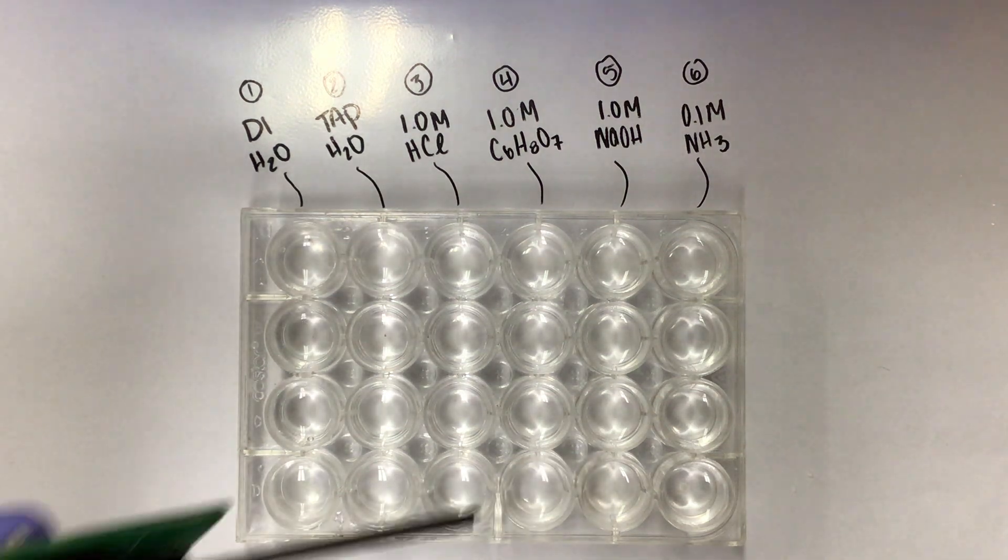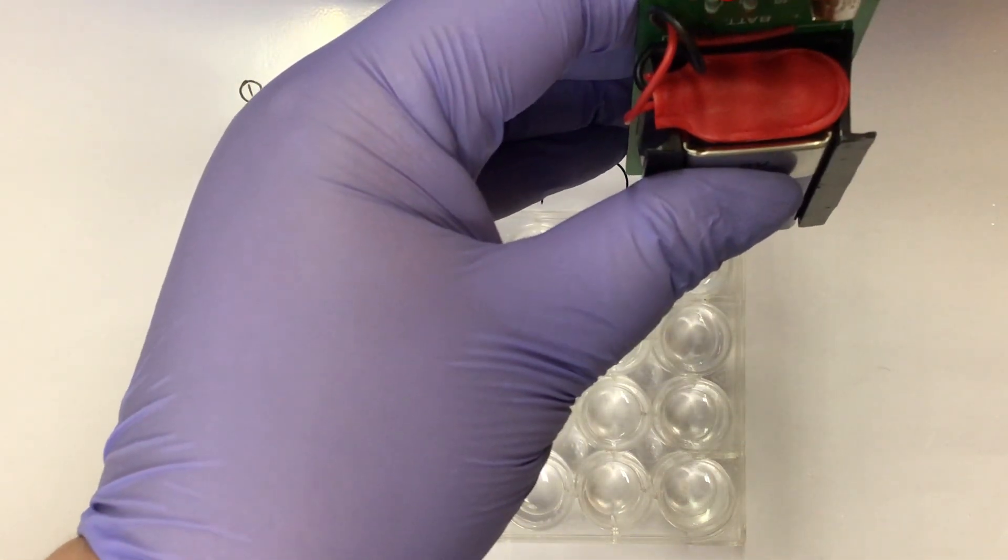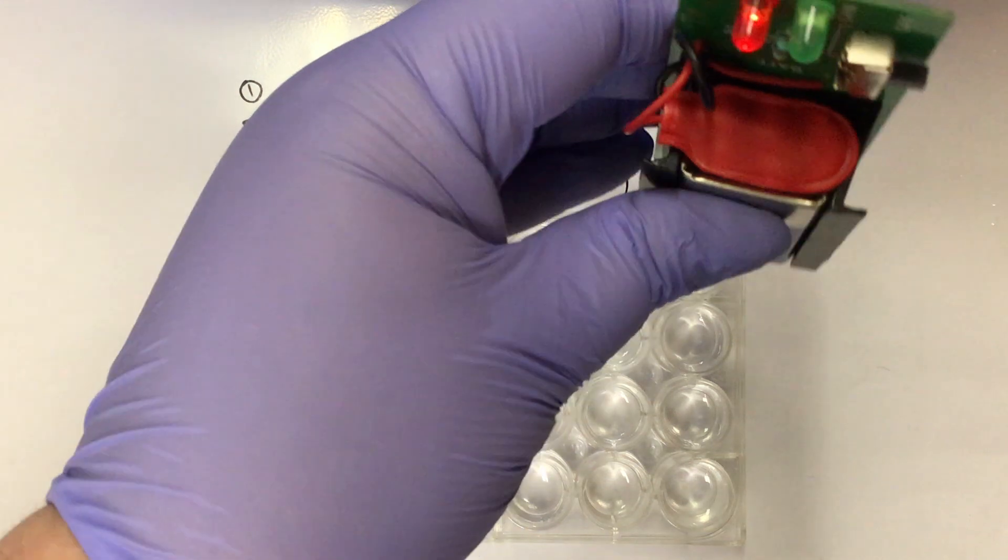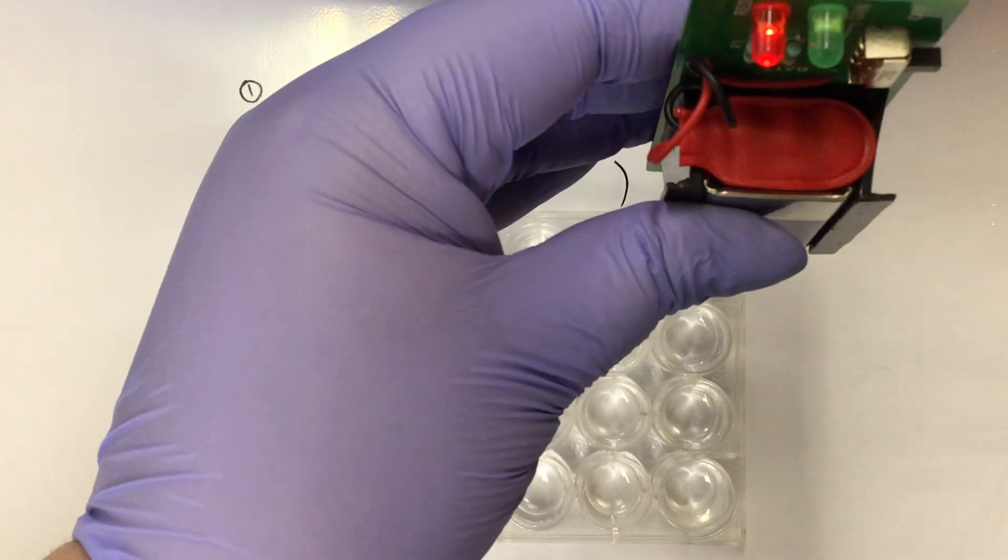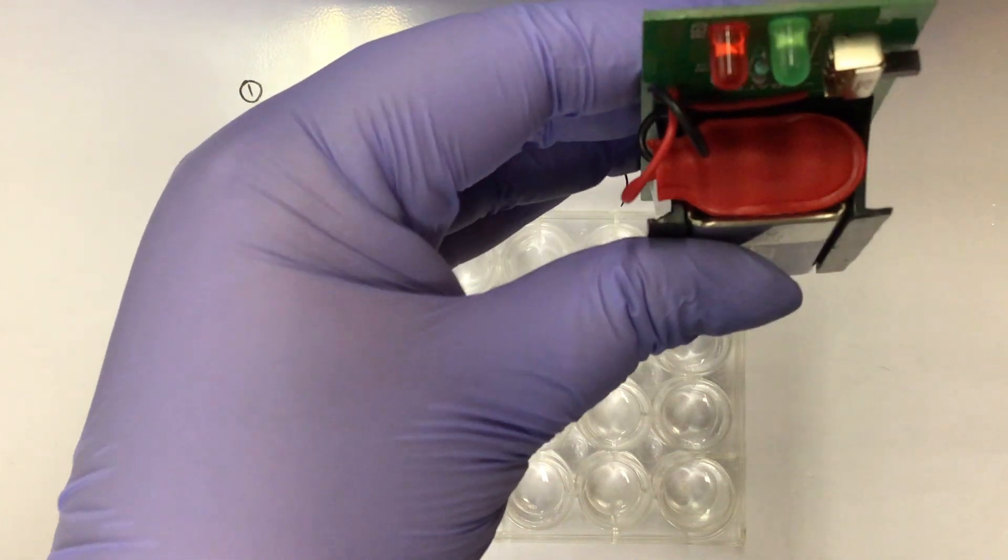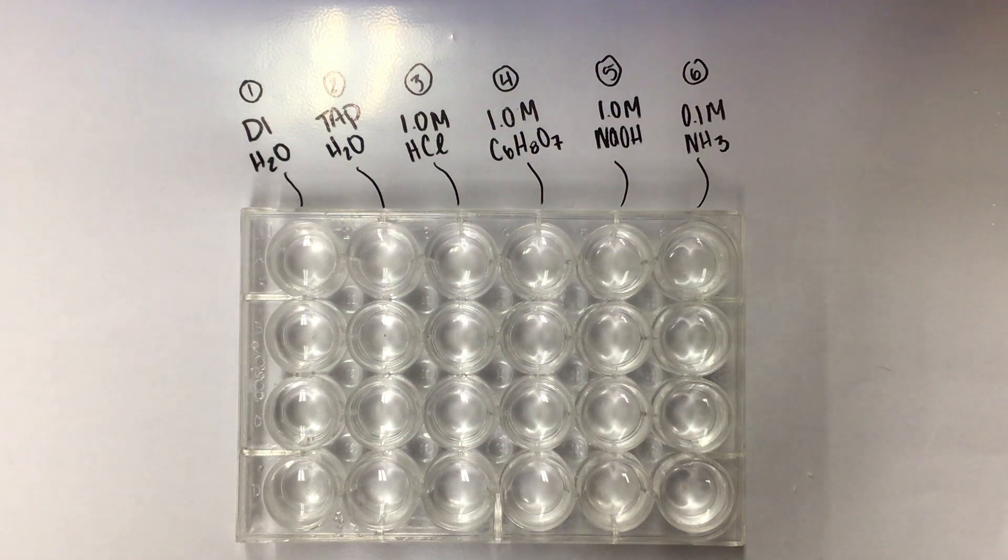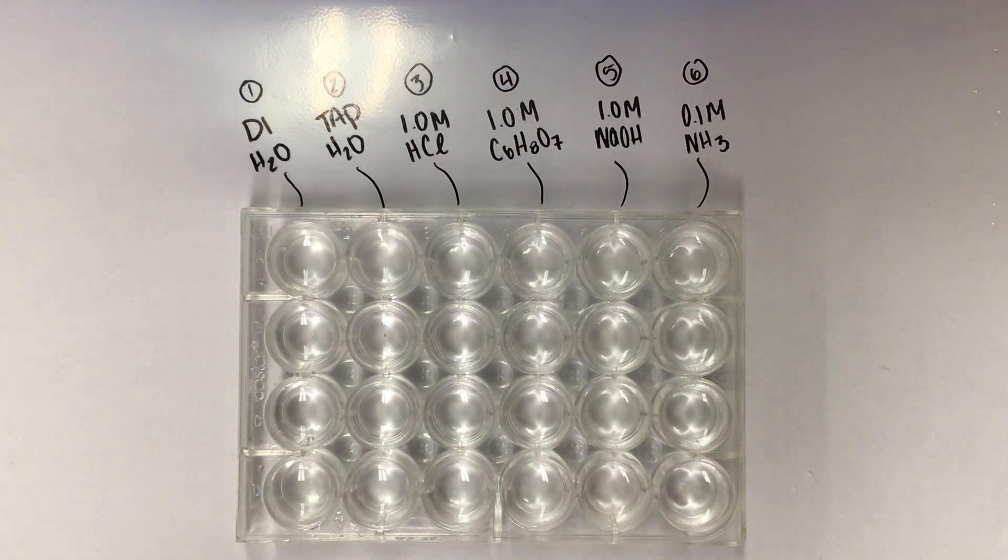And lastly, 0.1 molar NH3. For this one, you can see that red light bulb, it's really barely illuminated. The green light bulb is not lit at all. That's it for our conductivity tests.